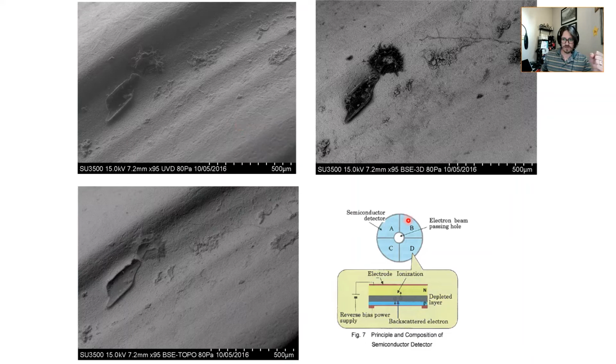And so you have to use this semiconductor type detector. And in the olden days, this was called an environmental microscope, or an environmental SEM. Nowadays, we can put kind of non-conductive, or I did my air quotes too soon, wet specimens in a traditional SEM that has specialized detectors.